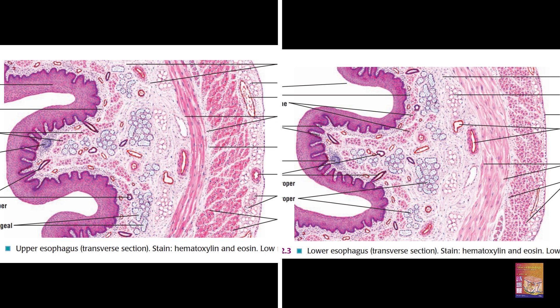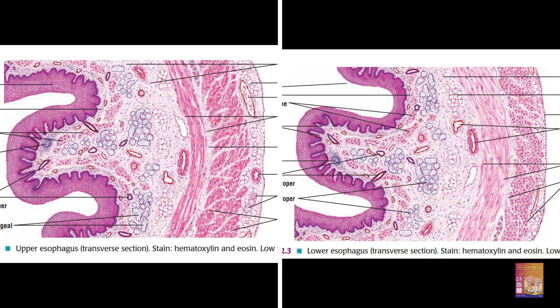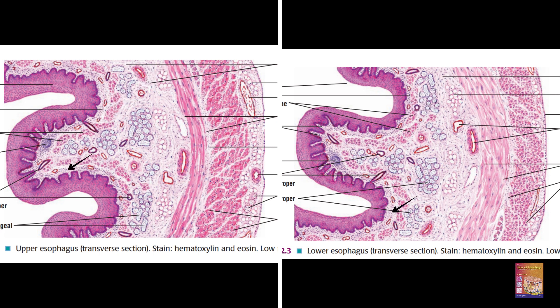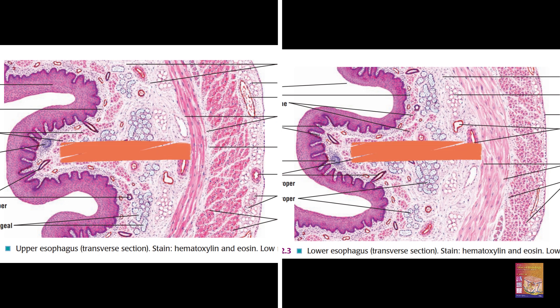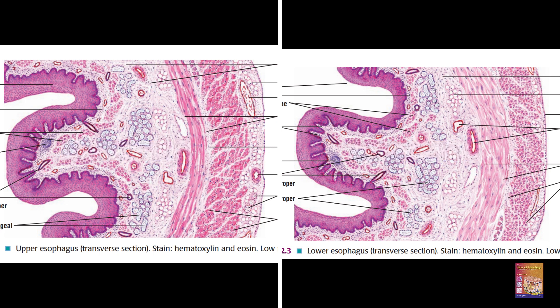Now let us look at some pictures from the Difiore's Atlas of Histology, 11th edition. In both pictures I can see a thick lining epithelium — most probably the non-keratinized stratified squamous epithelium. Then we have the lamina propria with blue dots for connective tissue cells, arterioles, venules, and a lymphatic nodule. Then we have the muscularis mucosa — the thin, tiny muscle layer. So this portion is the mucosa. Below this we can see the submucosa with connective tissue cells, arterioles, venules, and esophageal glands.